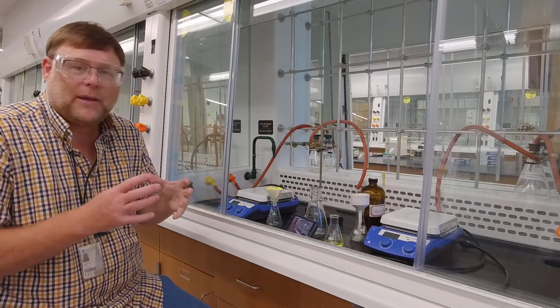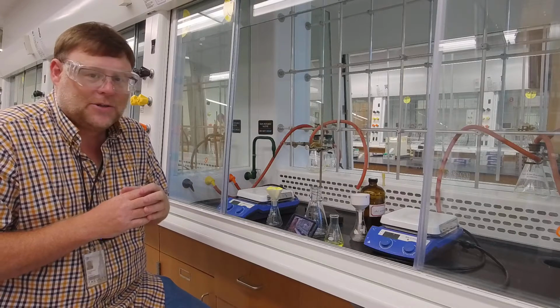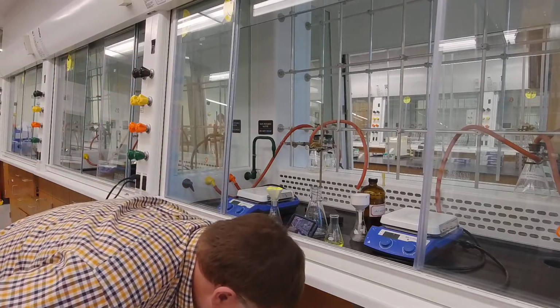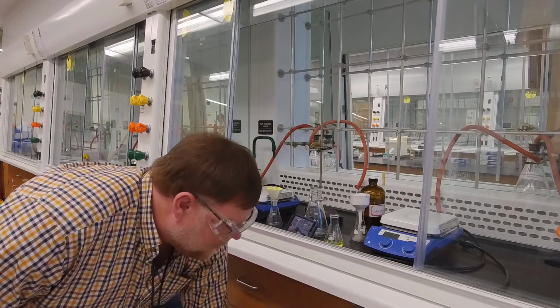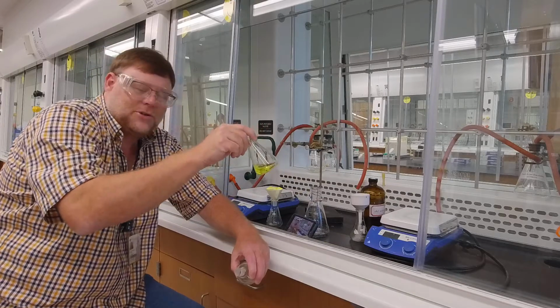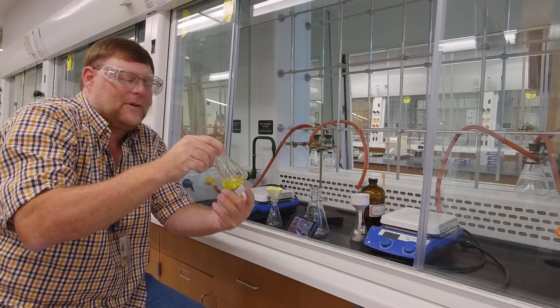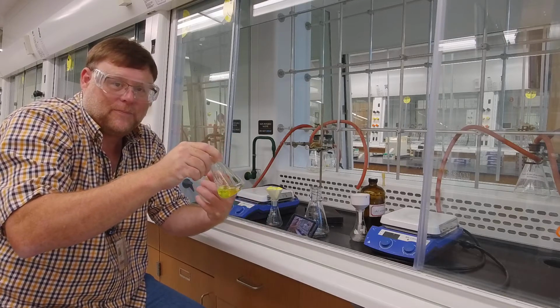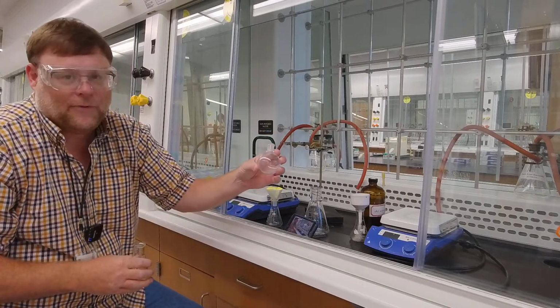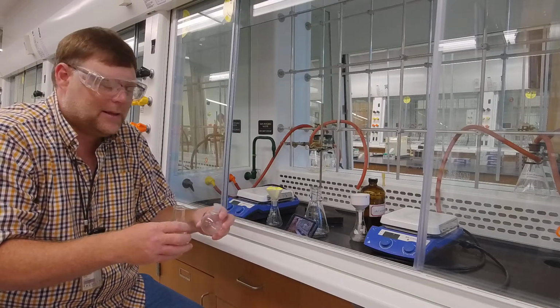The rotovap, one of the key tricks, I guess, to the rotovap is that we're going to apply a vacuum. When we apply that vacuum, if you put something like this under a strong vacuum, anything with a flat surface is going to be bad for a vacuum, and it will probably implode. So we want to use a round bottom flask. When we apply a vacuum to a round bottom flask, the pressure is evenly distributed.